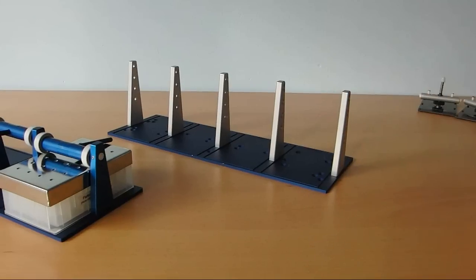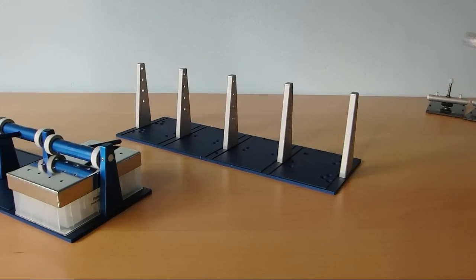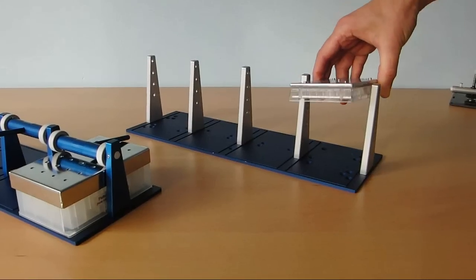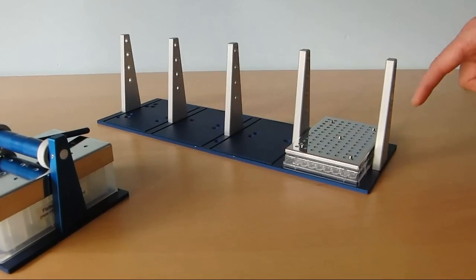The second clamp system is a universal clamp system. It still allows the clamping of a single deep well microtiter plate, but it is primarily designed to clamp multiple low well microtiter plates on top of each other.